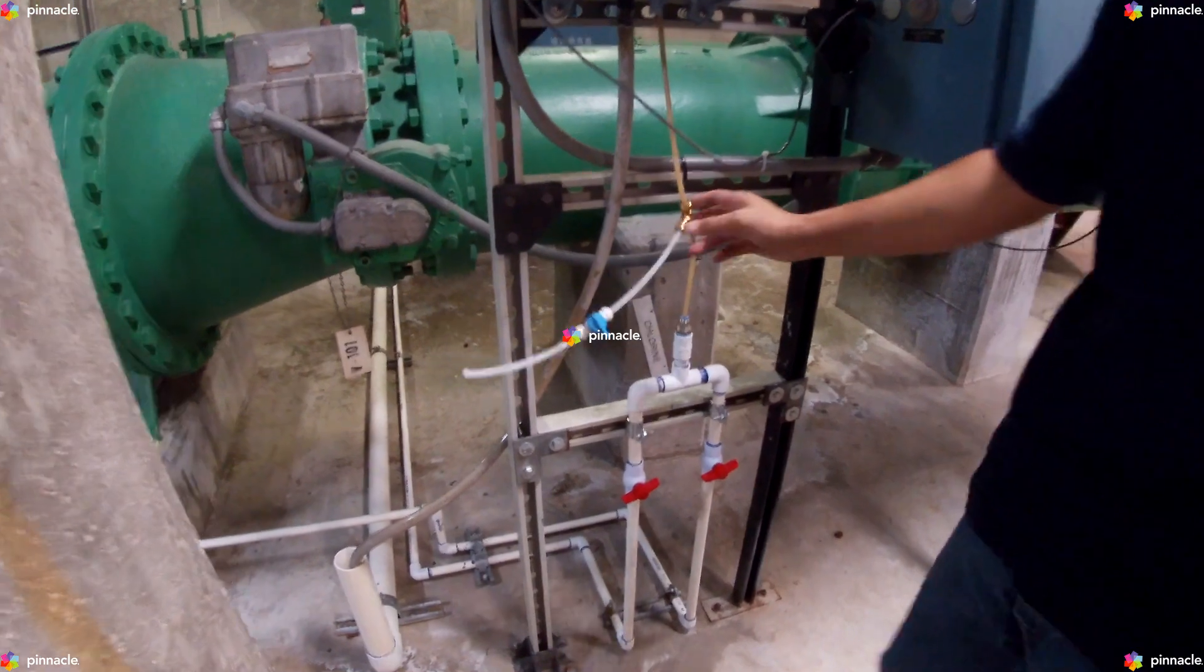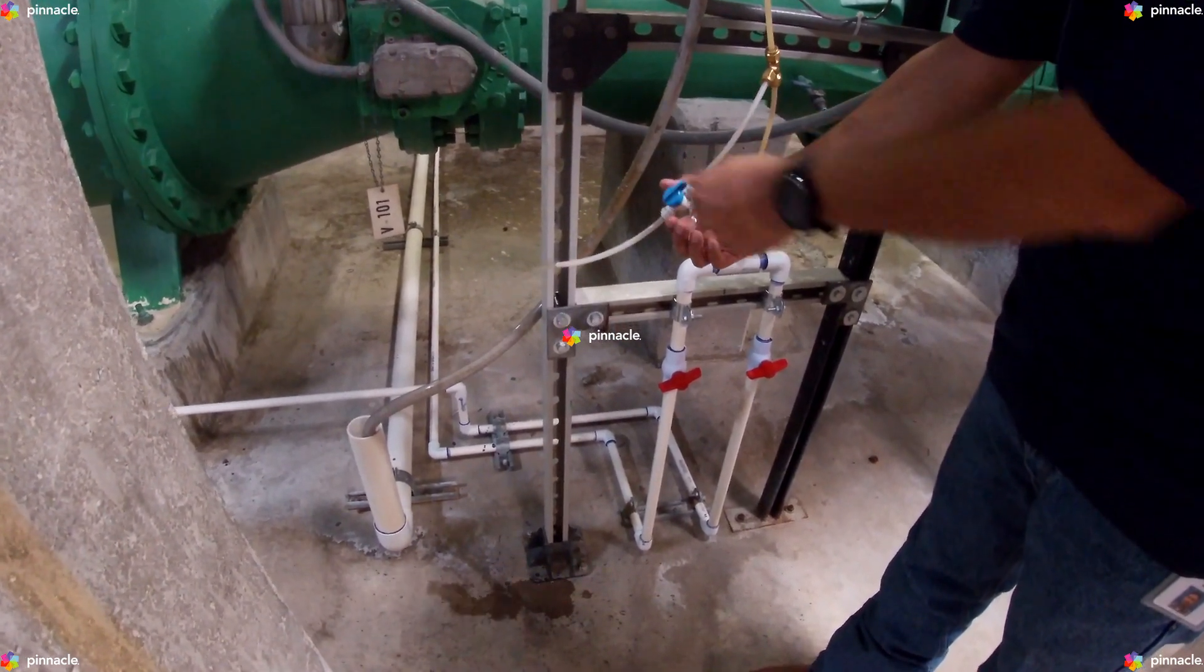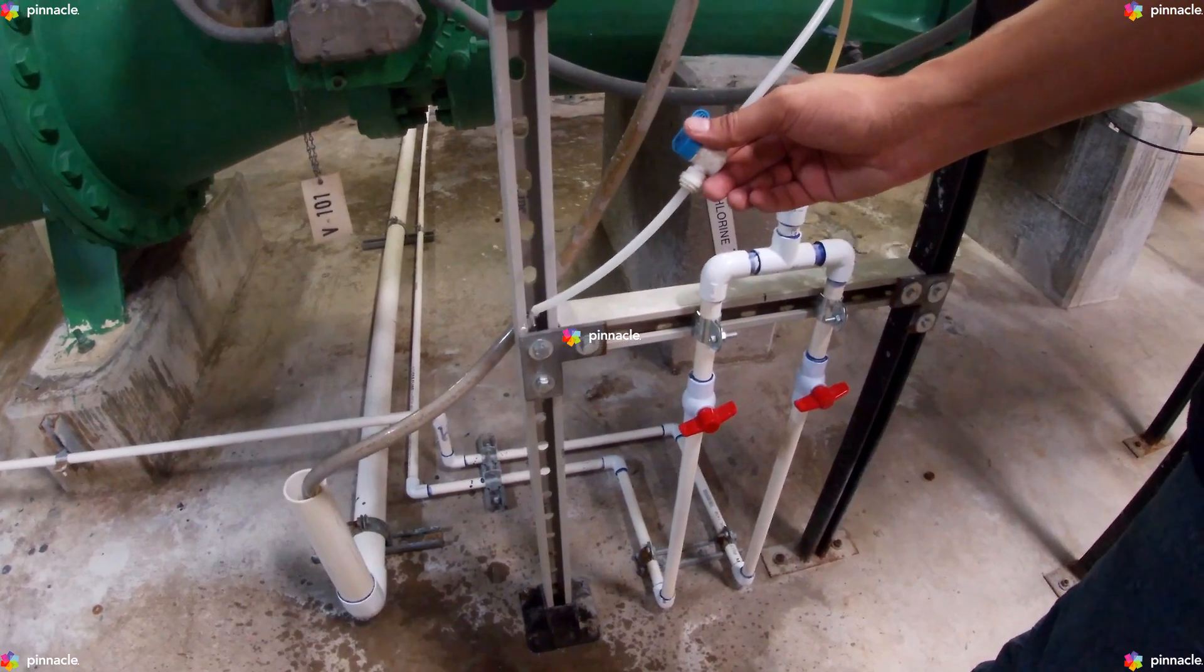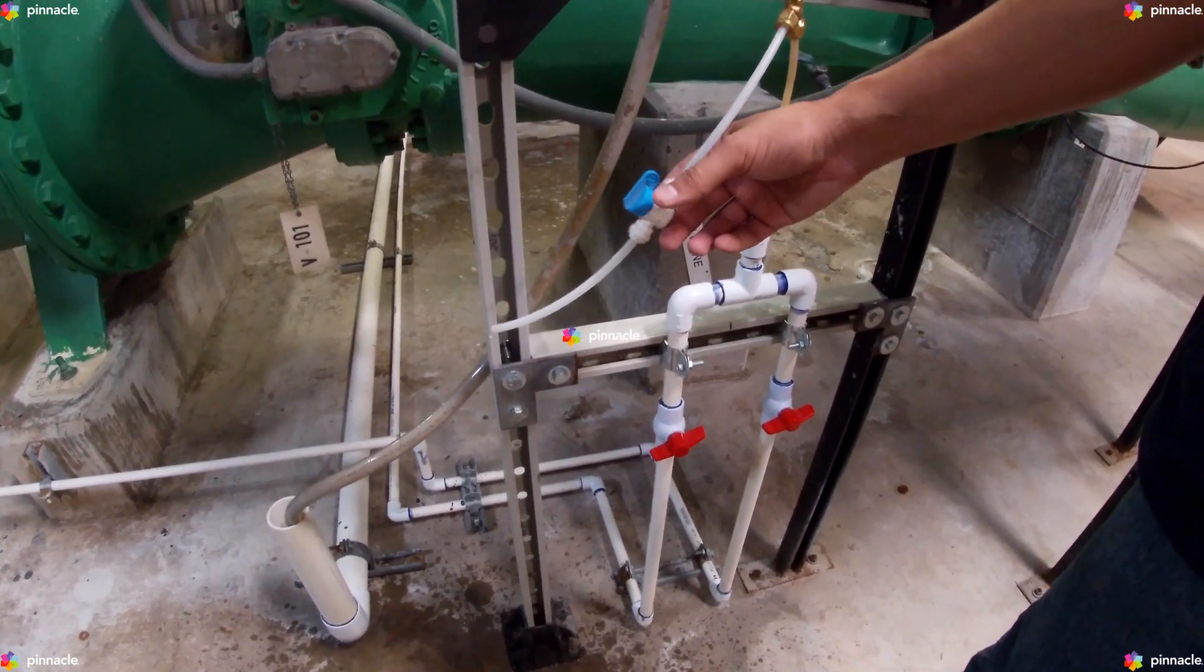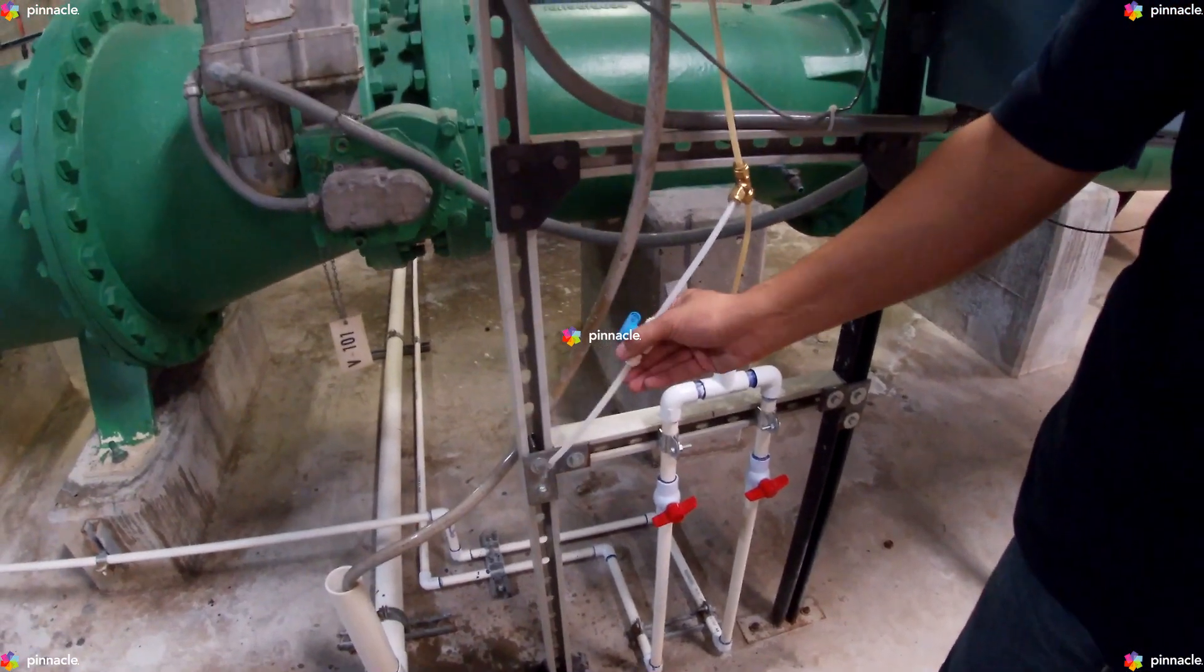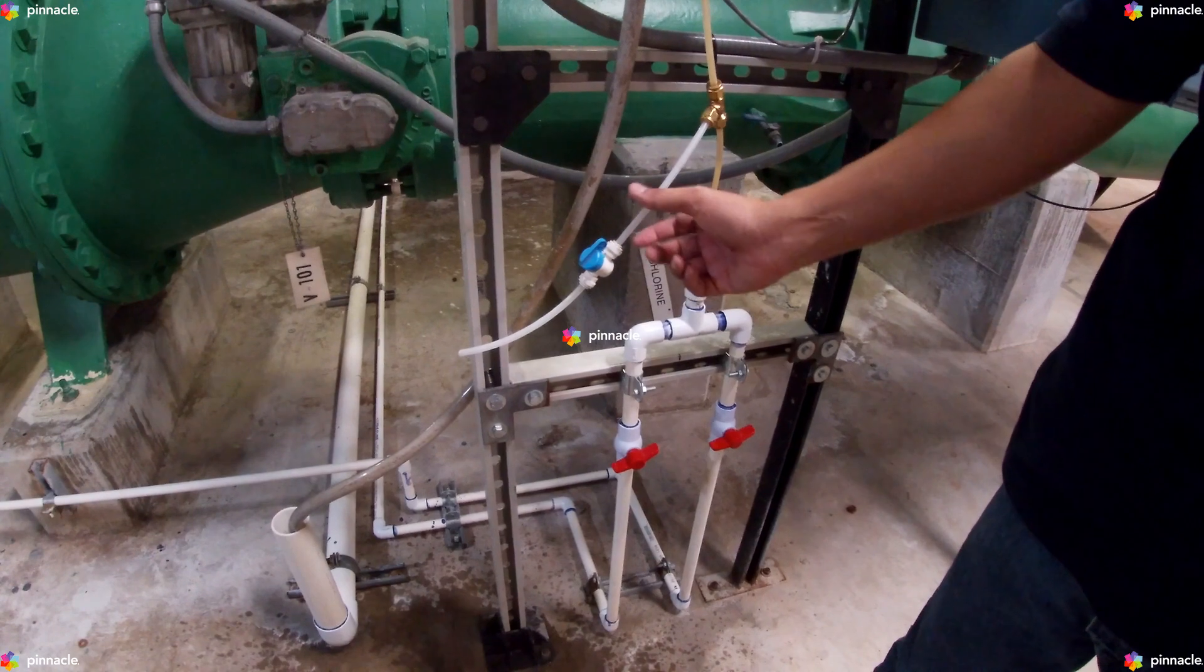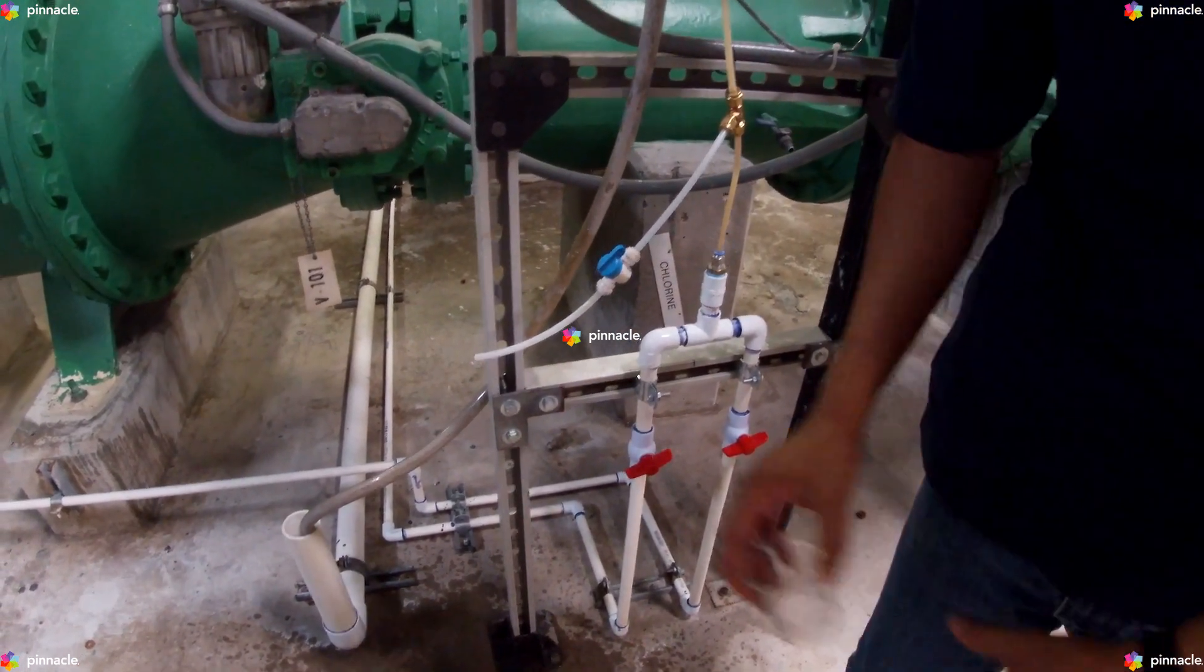We will begin by flushing our sample line. Once we have properly flushed our sample line, we can move on to collecting our sample. We will need to collect at least 40 milliliters of sample.